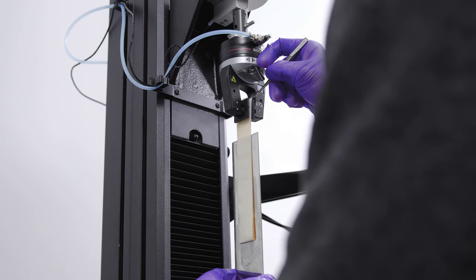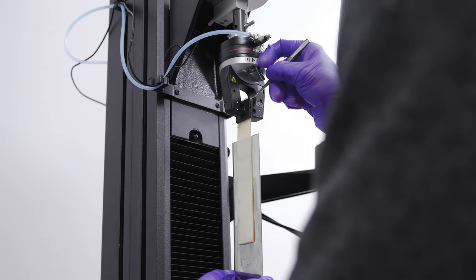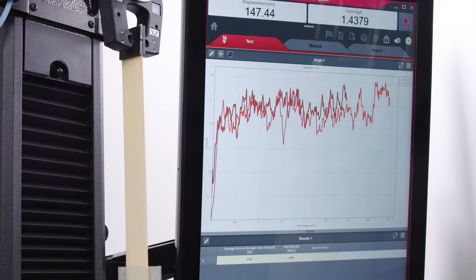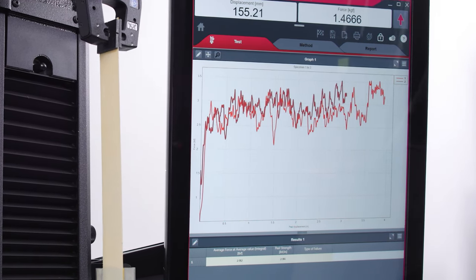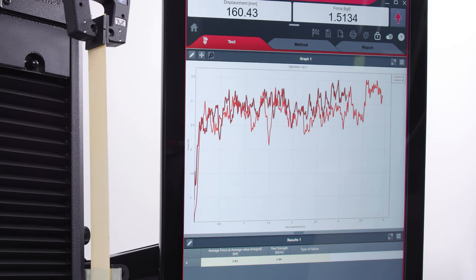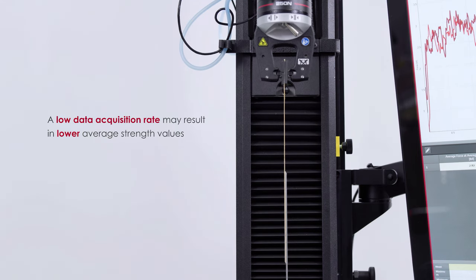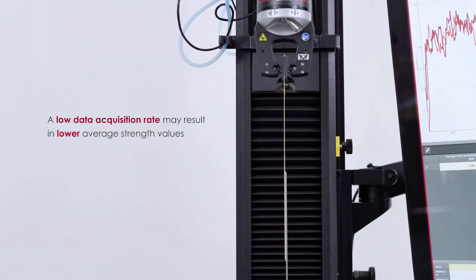Specimens are tested in tension at a 180 degree angle. Because peel testing data is prone to peaks and troughs, the testing system should have a high data acquisition rate. A low data acquisition rate may result in lower average strength values.